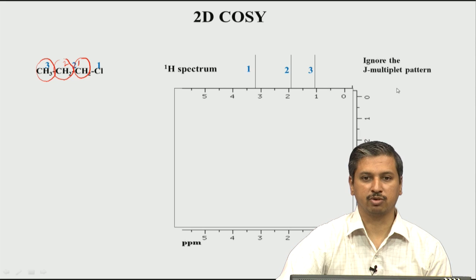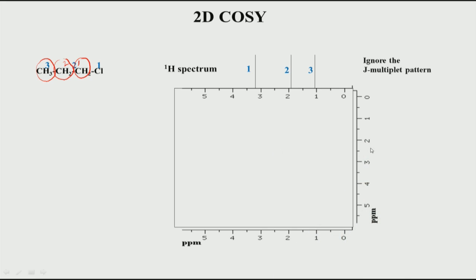So, now let us come to the 2D here. So, I get a 2-dimensional plane. So, this is a 2D NMR. So, I am recording 2D of this spectrum. You will have one axis which is the t1 axis, that is all proton, and this is also proton. So, we are looking at 2D COSY, which is a homonuclear correlation experiment. That means both dimensions will be hydrogens, protons, or both can be carbon. So, we can also have a carbon COSY, keep in mind, and we can also have a proton COSY, but again the most popular is proton COSY, and we are going to look at only proton-proton correlation.